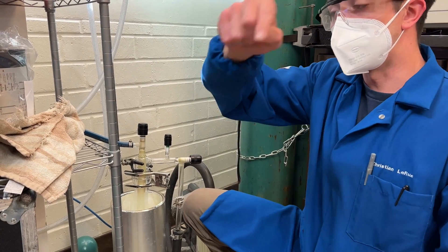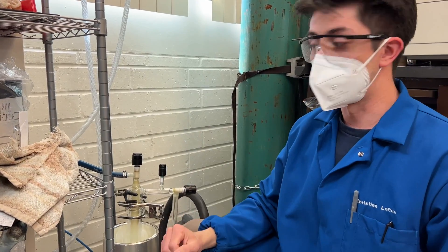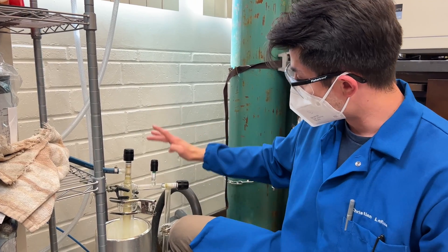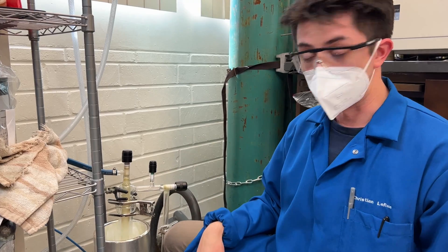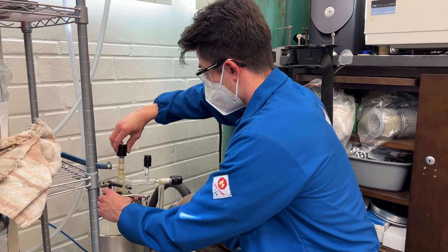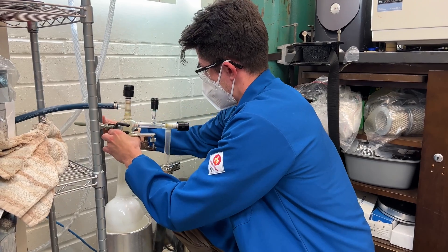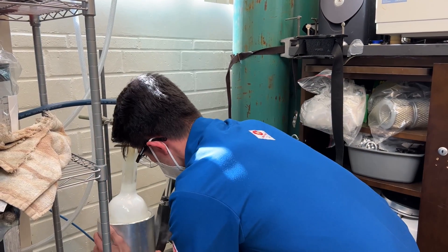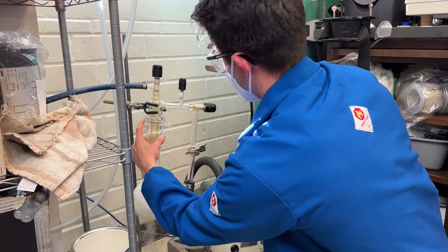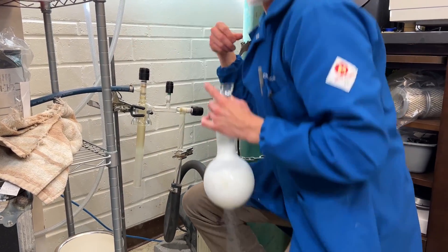We close the valves in the opposite direction as we started — we closed the secondary valve and the main valve in the glove box. Now we're going to close our main valve here on the trap, lifting it, opening up the vent, and removing the bulb. This will be done relatively quickly. So closing the valve here, closing the valve there, we're lifting, and we're going to take our bulb directly to the hood.